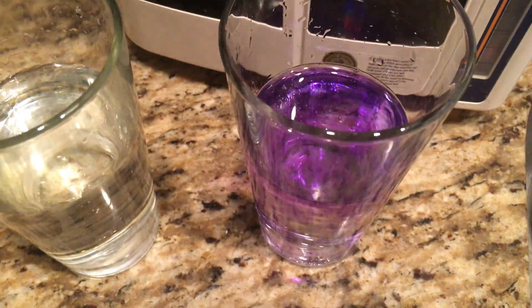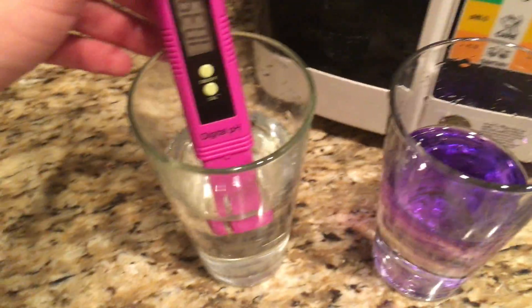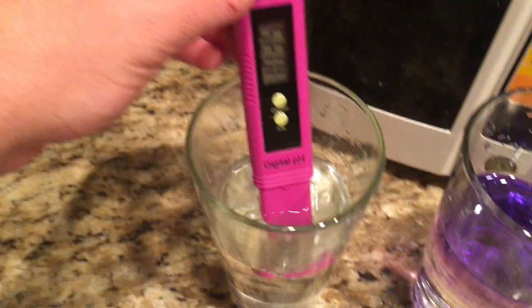And voila — this is so useful because I don't have to waste liquid, whether it's juice or anything else other than water. I don't have to waste it anymore by putting drops in it. I can just stick this in and be done with it within seconds.